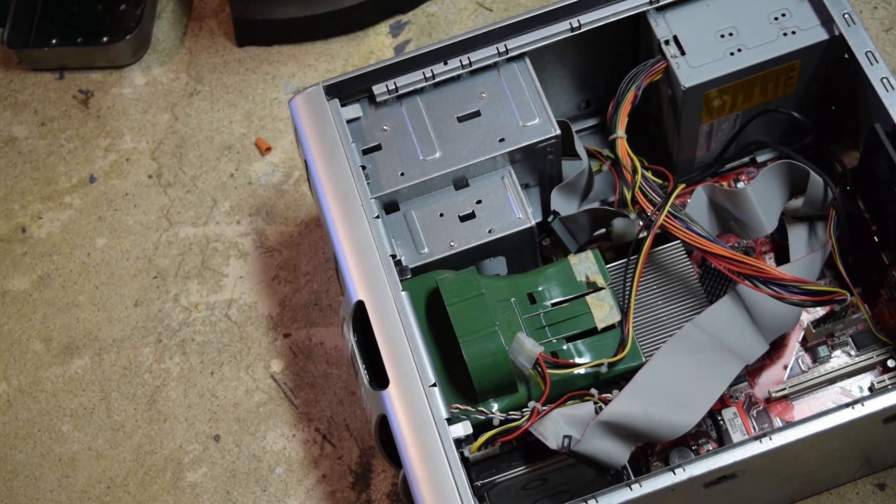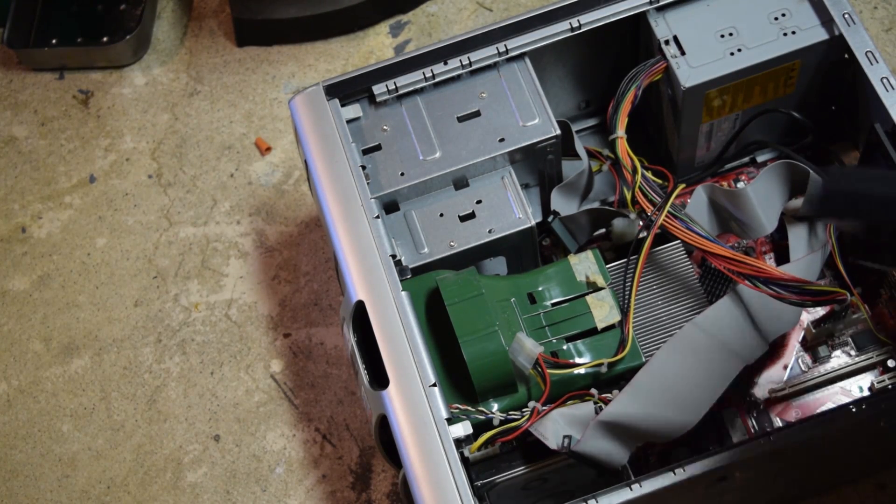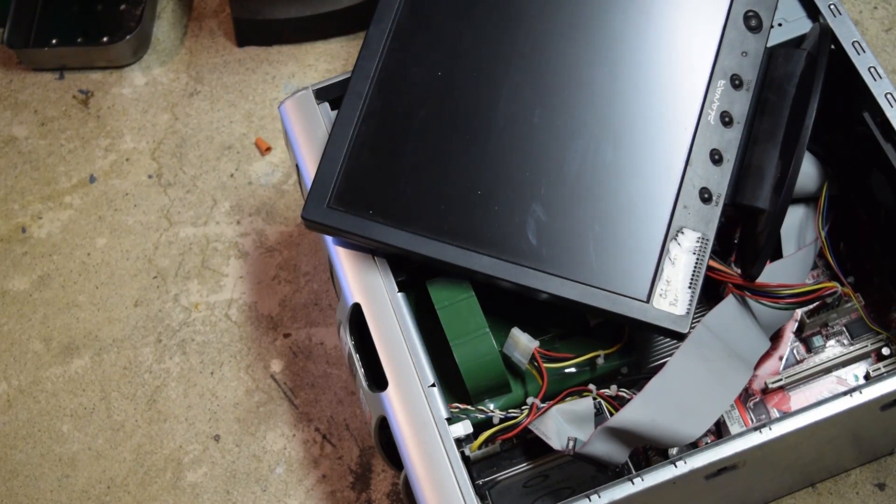In this video I'll be showing how to build a magnetic stirrer using parts mostly from an old computer and old monitor.